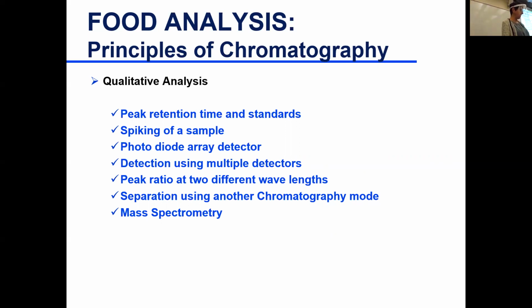You did the detection and identification, and you calculated the relative area, which is not quantitative because you didn't do standard curves. So there is qualitative, there's semi-quantitative, and there's quantitative. With qualitative, you're not doing any form of quantitation.